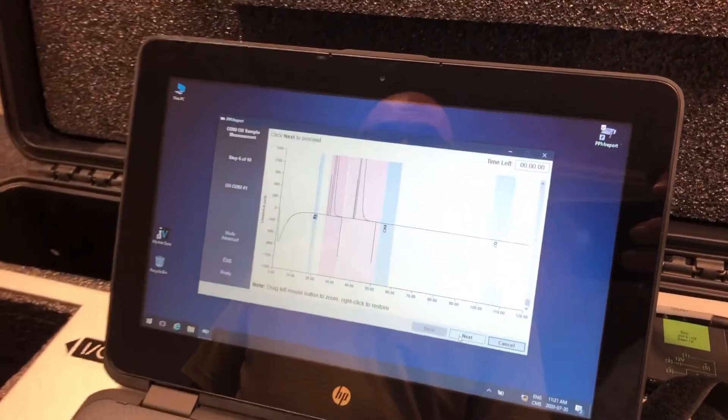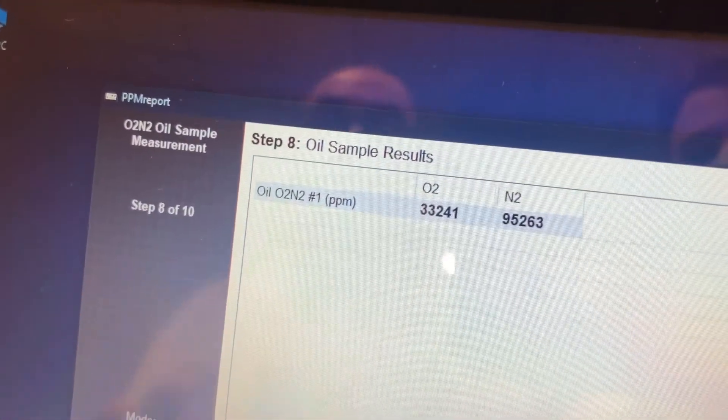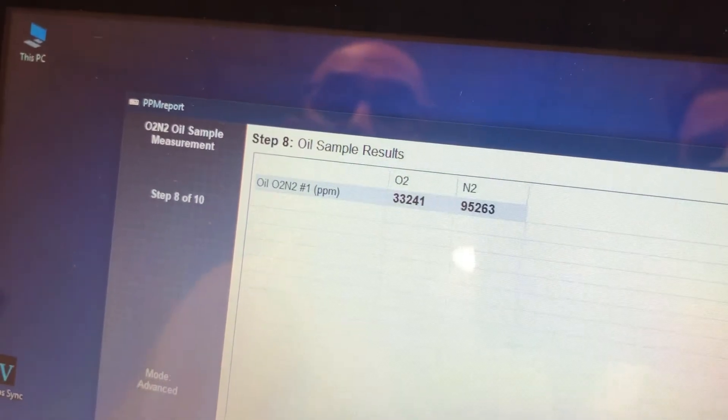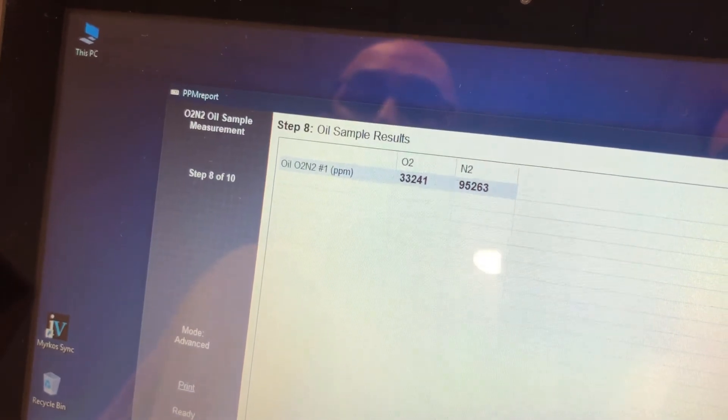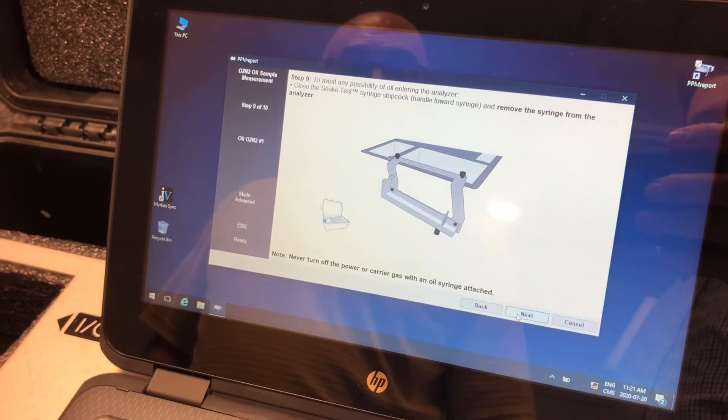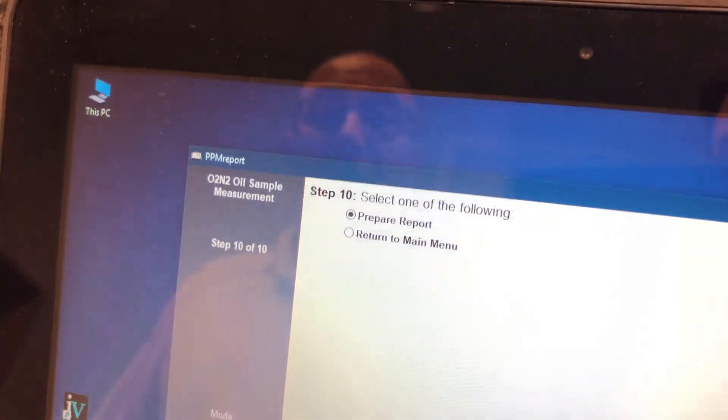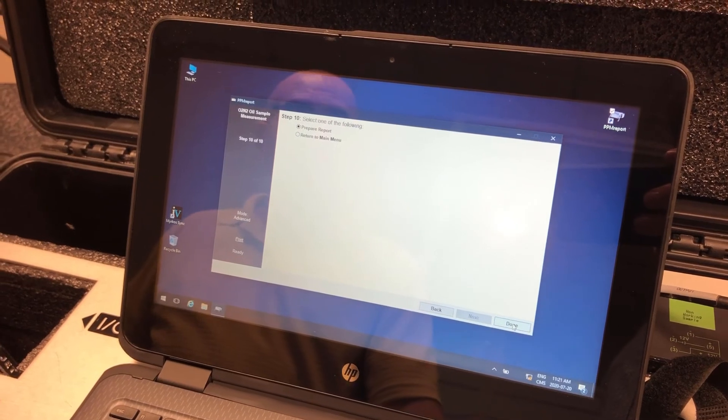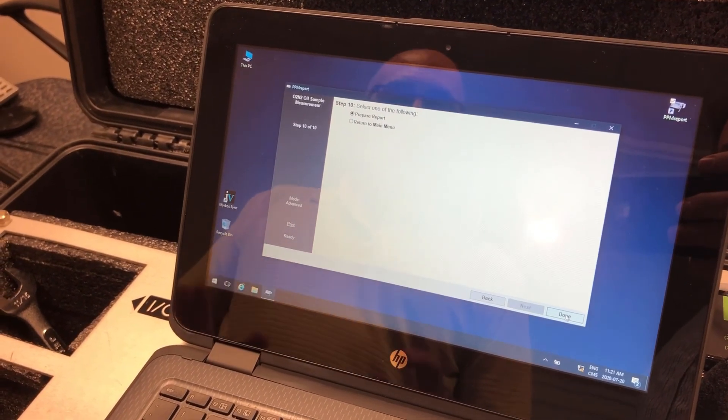So now we got our oxygen-nitrogen measurement. So you click Next. So here's your result. Frankly, it makes sense. In general, you always have three times more nitrogen than oxygen in the air when you look at the ratio. So this is your measurement. So you accept. You go Next. And now we're going to be at how to prepare the report. So you click Done. So now you have done your nine gas DGA analysis completely.